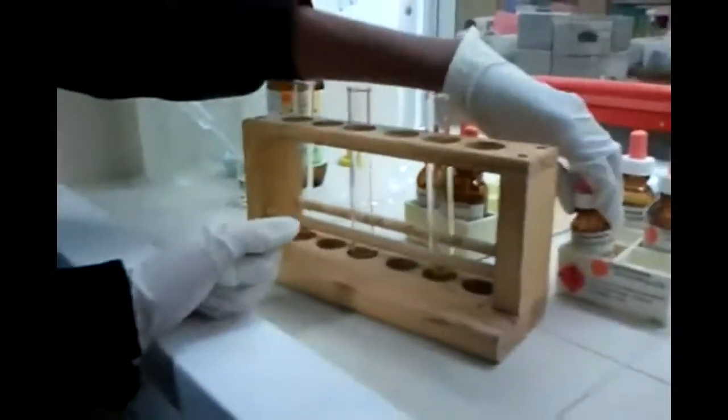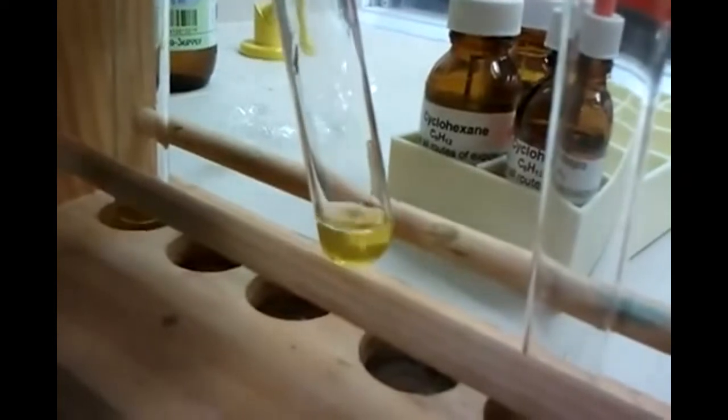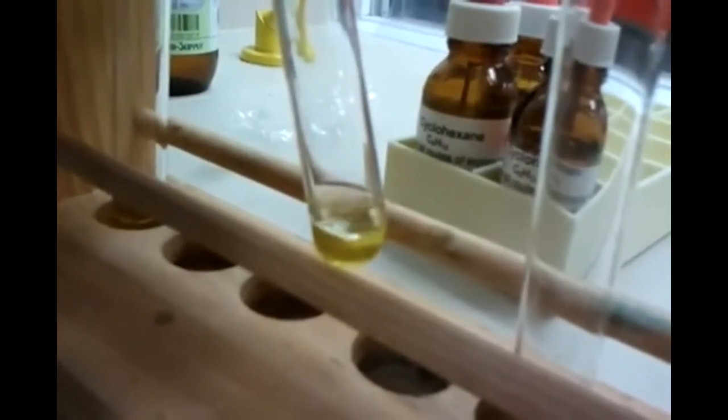Next one is cyclohexene. This one should react. We will see some decoloration of bromine water if it does react. Do watch. It's yellow. It's not reacting. This one should. Keep going. I have to do the hexane a little bit with normal hexane. This is a problem. Do we just mix it? Do we just wait? That would fail. We'll just leave it there for now. We'll come back to that.